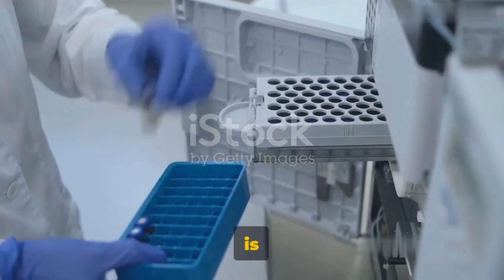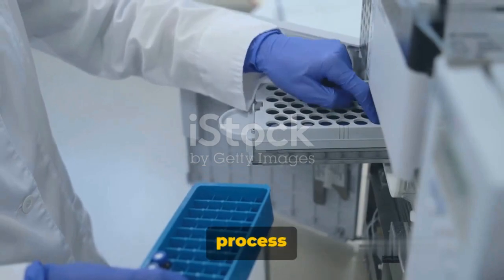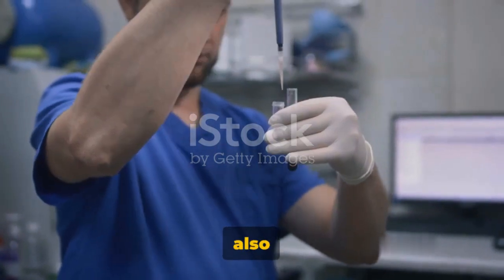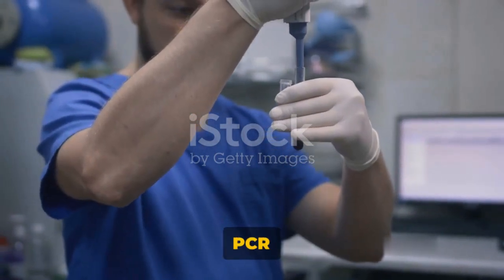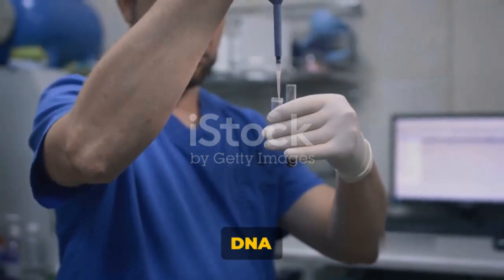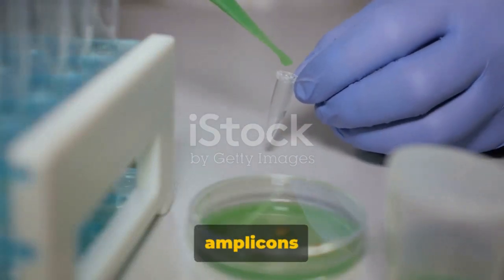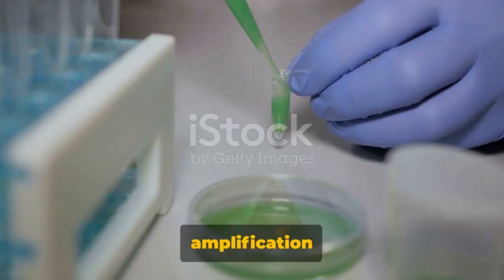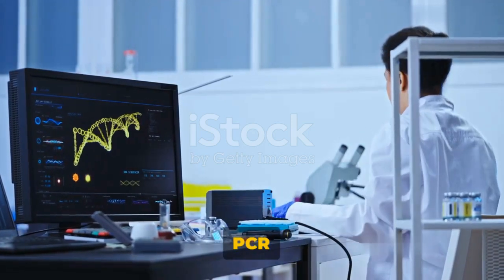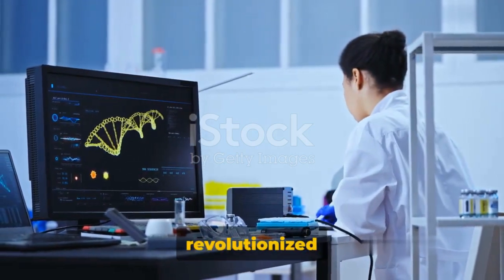real time. This is a significant leap from the conventional PCR method, where analysis only takes place after the process is completed. The real-time aspect of this method not only saves time, but also provides a quantifiable measure of the PCR product. The process hinges on a pair of primers complementary to the DNA sequence of interest. As the DNA polymerase extends these primers, the resulting amplicons are re-amplified, leading to an exponential amplification of the DNA molecules. With real-time PCR, we can monitor the progress of a PCR reaction in real time and obtain quantifiable results. It's a technique that has revolutionized molecular biology.